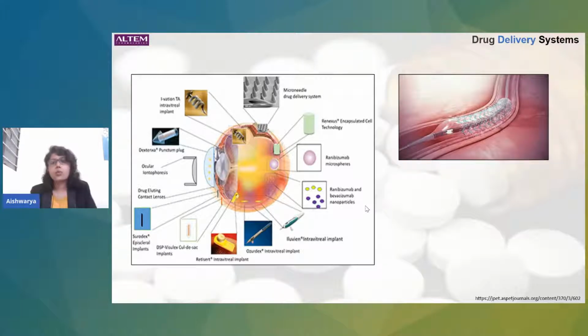So now, when you have a simple structure like a stent, which we've already developed previously, and if you're able to create something more biocompatible and something more drug eluting and more sustained, it is going to be a great victory in the field of medicine, that we are transcending from any sort of thrombosis, morbidity, any sort of negative impact of drugs on the body, or rather eluting stents on the body. So we are trying to transcend from whatever side effects that we have been seeing with the drugs, and we want to proceed to eliminating those.